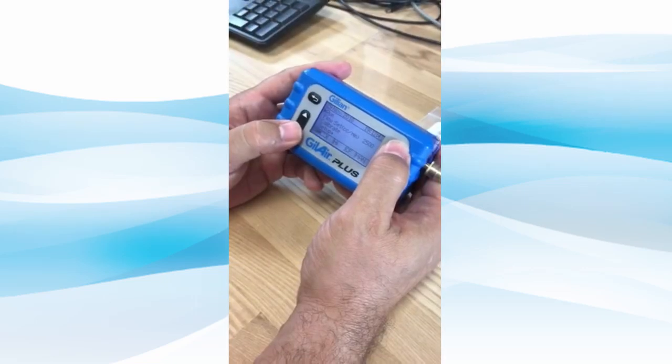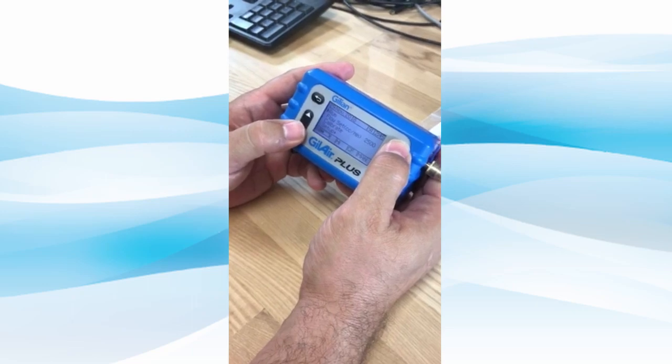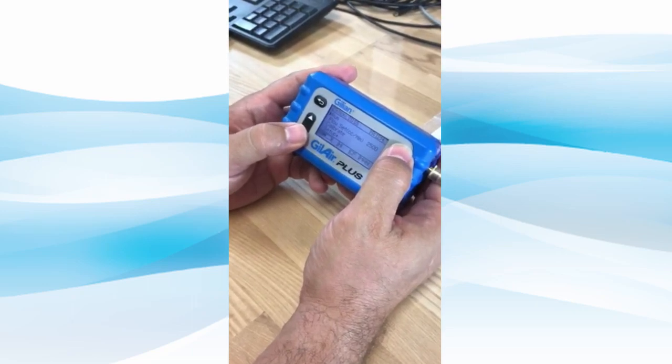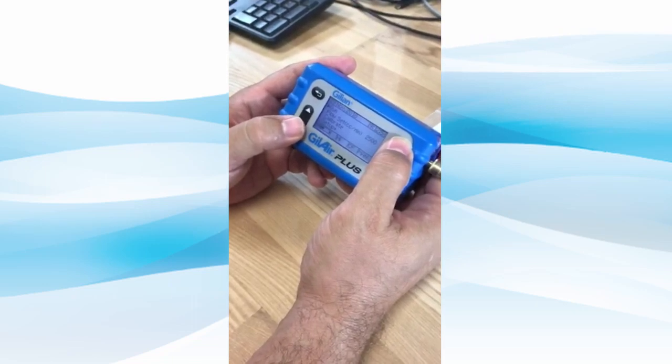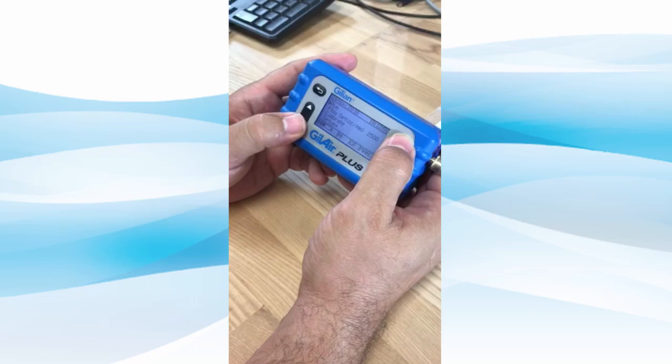Set the desired flow rate on the Gillair Plus pump while in the constant flow mode. Ensure the Gillair Plus pump is calibrated to your desired flow rate. Please reference the operations manual for information on calibrating your Gillair Plus pump.